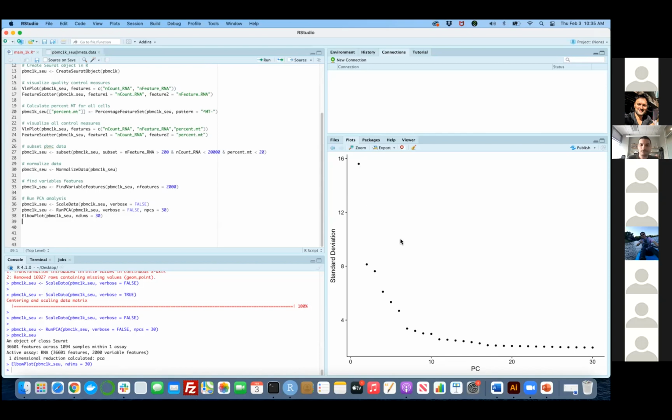Yeah, so I meant about those 2000 genes that we picked earlier as variable features. Mm-hmm. So their deviation is used for the PCA? Yes. Basically, we have the same or a manageable amount of the variance that is represented by 2000 genes, but we collapsed it to some 20 new variables. I see. Okay. Yeah. So that is the basic ideology of dimensionality reduction analysis, regardless of the fact that we are doing a single cell analysis now. You can see that the same application is done everywhere.